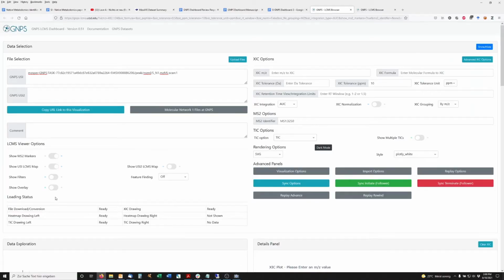Hi everybody, I'm Daniel, and in this video I want to walk you quickly through the GNPS dashboard and show you how you can quickly visualize LC-MS data in the GNPS dashboard, which serves as a web browser based LC-MS visualization and analysis tool.